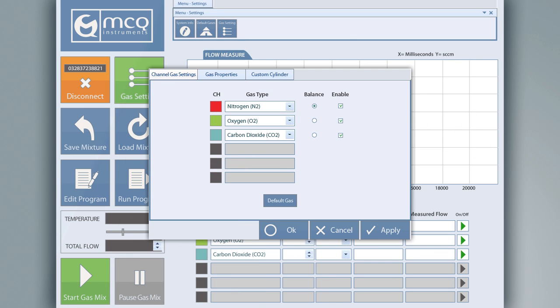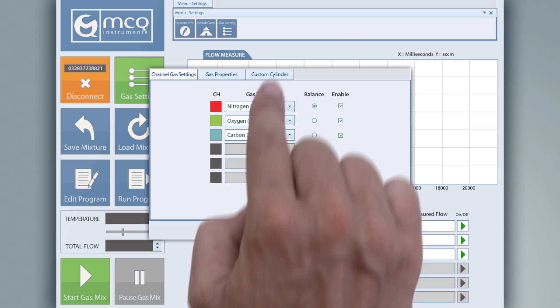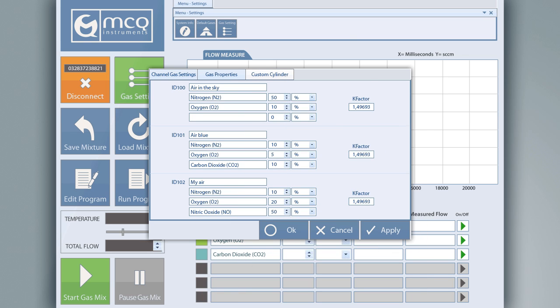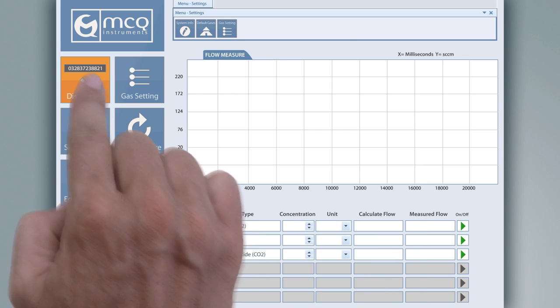It also allows management of each channel to define the input gas type provided from your own cylinder or to set, if needed, your particular gas mixture.